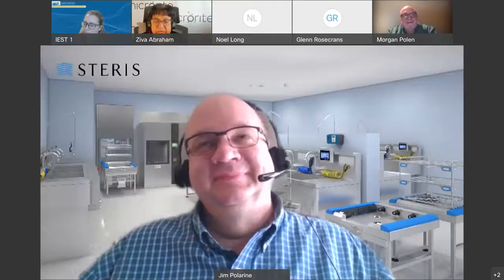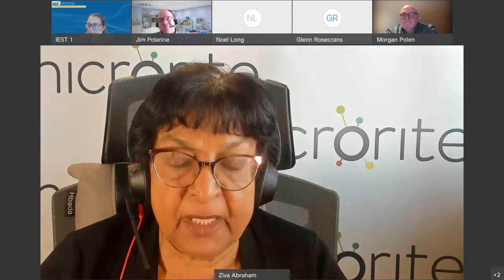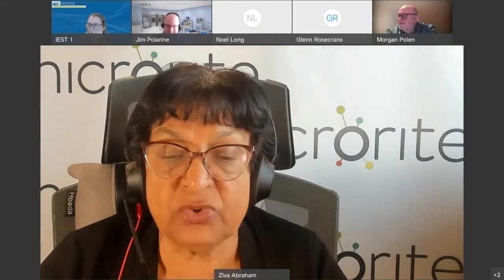I want you to understand another thing. A good identification is worth it. If you don't identify it correctly, you will never be able to investigate it and never be able to remediate it. And I'm going to give you a case study here, which I really want you to listen carefully to. I got a call from a company in the Far East asking, what should we use to disinfect people's feet? And I said, what? He said, we have fungus. I said, why do you do that?